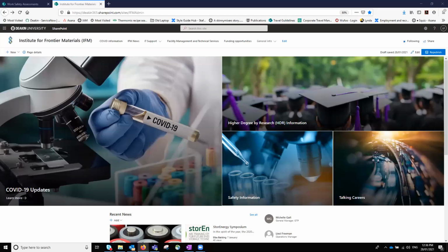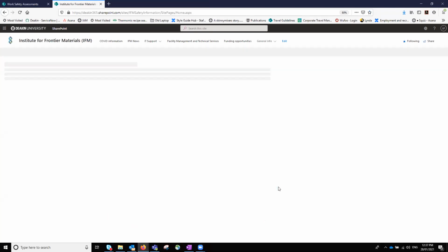The following video will provide instructions on how to complete your work safety assessment and any associated supplements prior to working in IFM laboratories. You can access the WSA website from the IFM SharePoint site, also known as the IFM intranet. From the home page, click on the Safety Information tile.